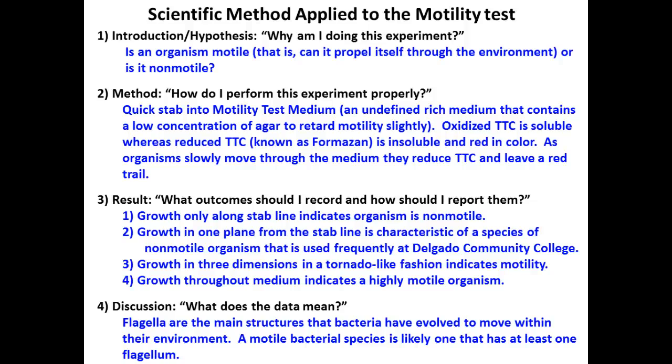Some organisms can produce slime and kind of glide along solid surfaces. Others can kind of twitch and move. But all the ones that we're dealing with are movement by flagella. Okay? So they're swimming through, being propelled by their flagella.